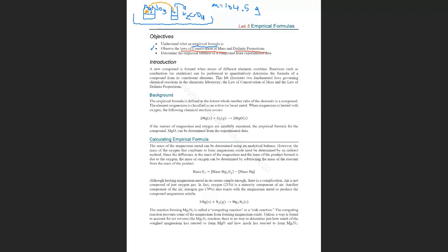What am I going to see? I will mix two liquids and I see a red precipitate. That is a clear indication that I have a chemical reaction. I will see a precipitate of silver chromate.